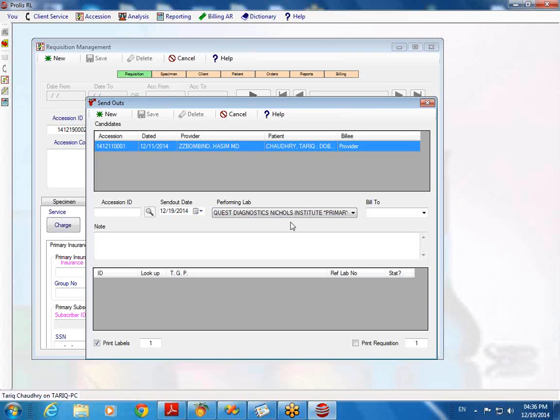Okay. It's a little bit complicated at this point, but no, it's interesting to just explore.